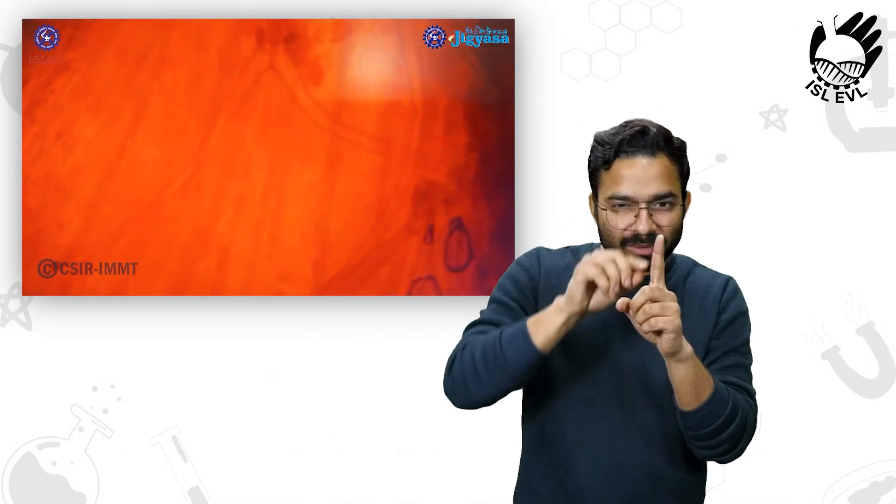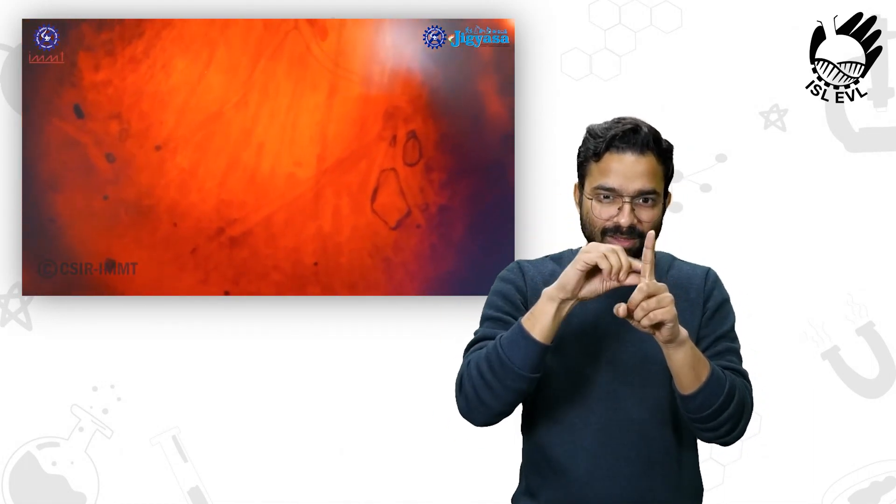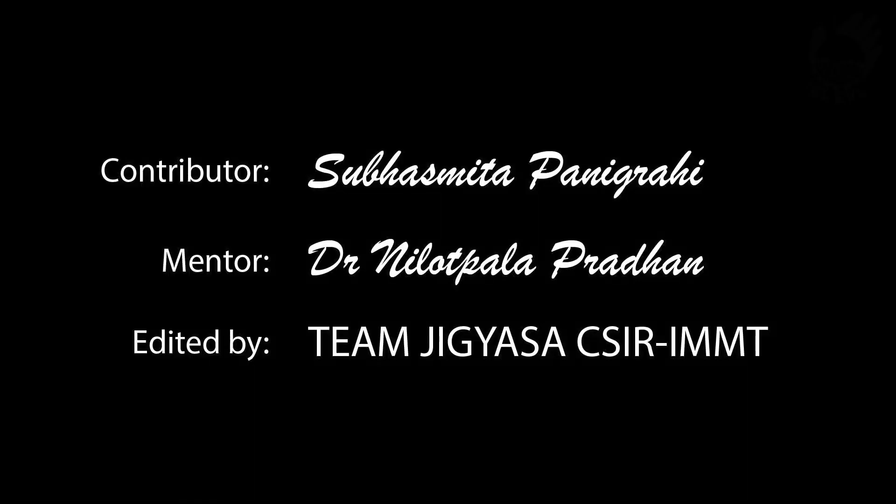This is a single pollen tube. You can see the pollen tubes here — they are inserted into the stigma so that they can reach the ovary. The thread-like structures are the germinated pollen tubes. Congratulations!